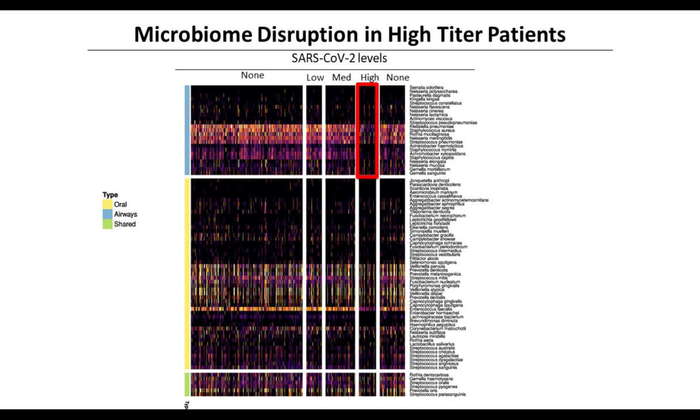But the interesting thing is when we look at the microbiome as well from this total RNA-seq data, we can actually see again that across none, low, medium, and high patients, these normal flora in the airways or oral microbiome are shared.